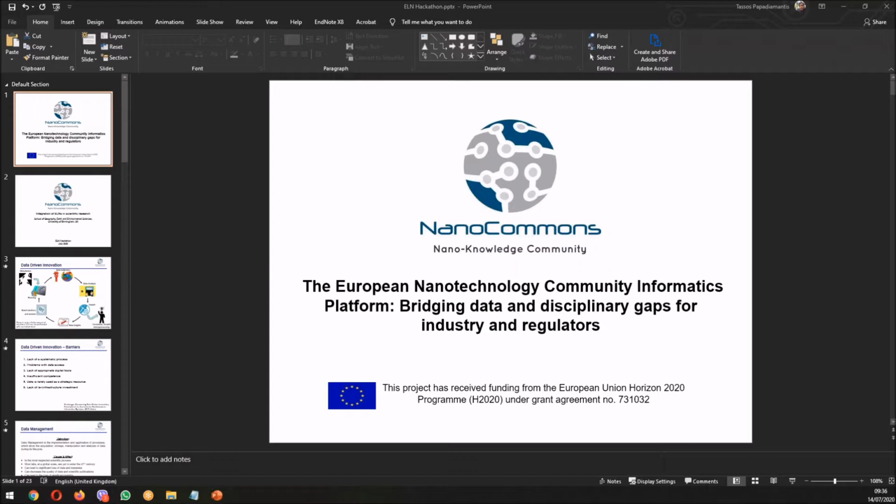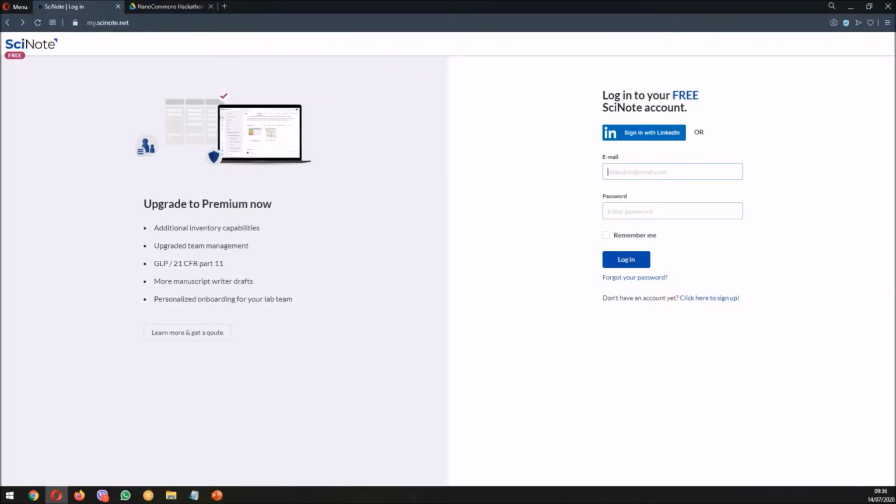Before we go into a quick presentation on why we are promoting and using the ELNs in everyday experimental and computational practice, I would like first to break the series of presentations by doing some hands-on practice, mainly an introduction to how you build your account.